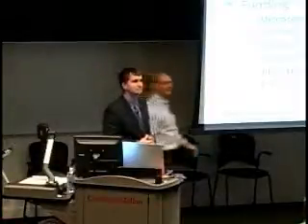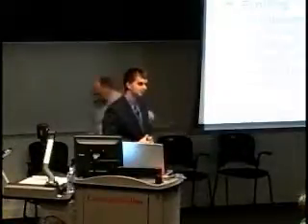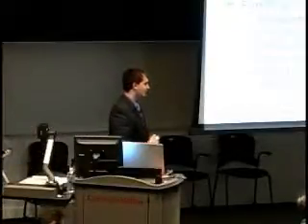The alignment issue, how do you resolve it if you have severe misalignment? So prior to this, we actually have to pre-process the data. That's one of the things that we haven't mentioned. Yes, the data has to be collected first. There's some stitching, some alignment, but we might still have some misalignment errors, and that's what we have to compensate for during the segmentation. So all we need is just a roughly aligned stack of images. It doesn't have to be fully aligned. But yeah, some alignment has to be done before.